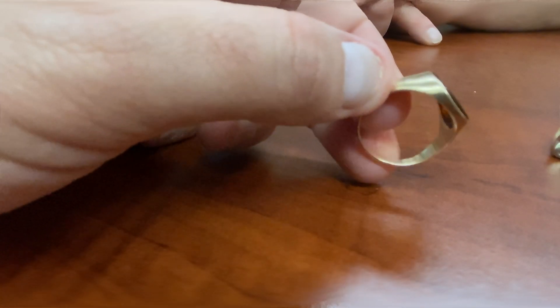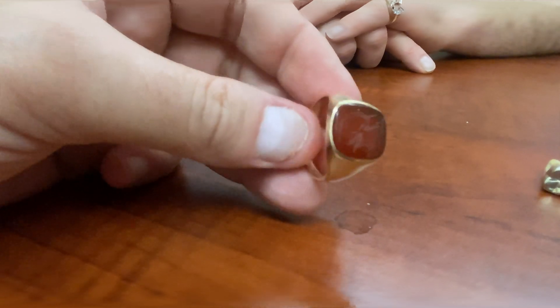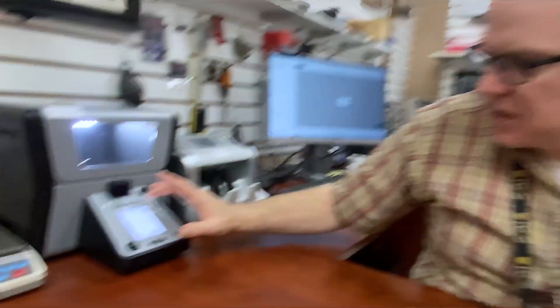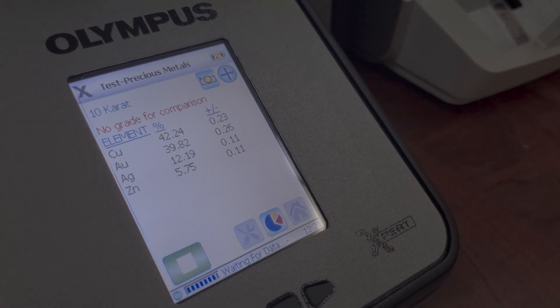Next time I need a crown I'm definitely going to ask for gold. We'll melt down a Britannia like Doug said for jewelry. Let's XRF your ring and see what carat it is. This is my signet ring — bought it from an estate jeweler several years ago. I feel like they told me it was 14 carat; I paid like four or five hundred bucks for it. Visual inspection shows a 10 carat hallmark on there. I honestly just remember it was not a high carat weight. This does come back as 10 carat — tests out just fine, visually everything looks good.